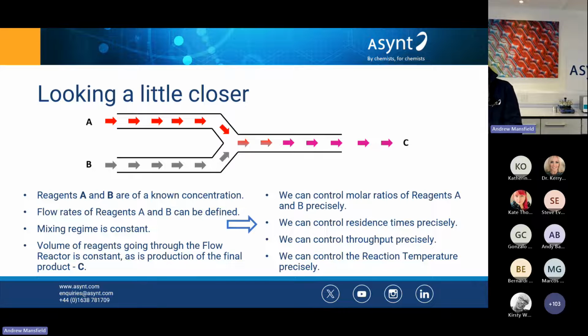So you can see just from that simple diagram, that simple illustration with a simple A plus B system, we're already showing better control of our reaction conditions. And that would be one of the simplest methods for a flow chemistry experiment. One reactor, A plus B.